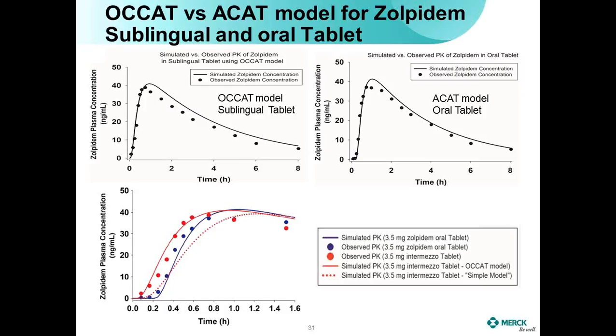We also tried the simple model. The simple model, shown as a dotted line, didn't predict the observed data well for the sublingual tablet.